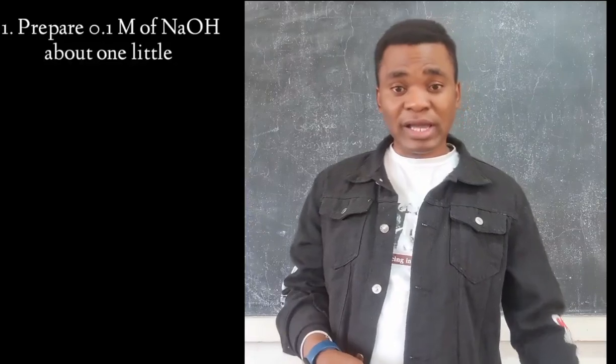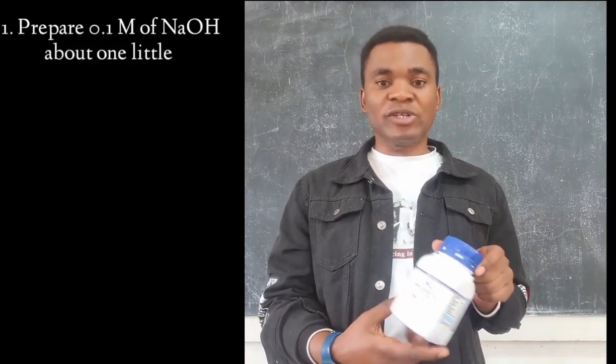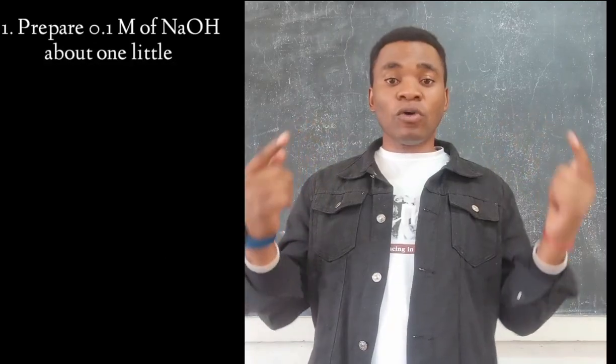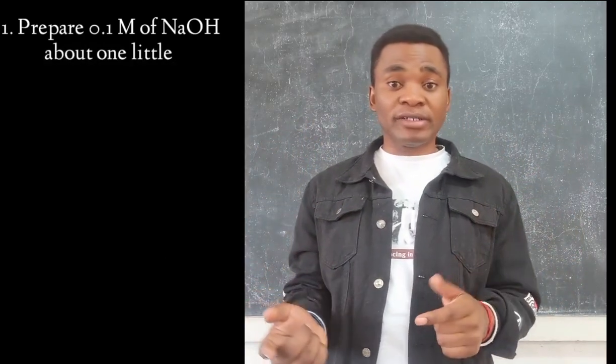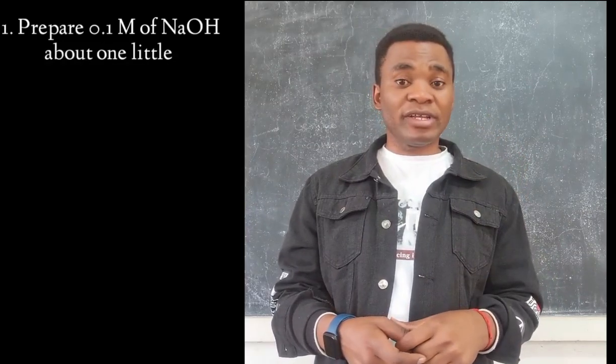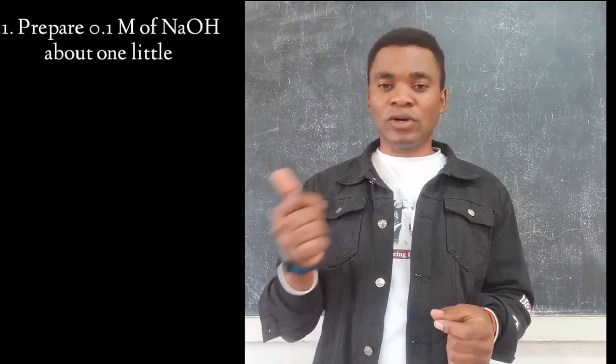So this sodium hydroxide, here it is. I have my sodium hydroxide pellets. And then what molarity and volume do they require? It is 0.1 moles per decimeter cube, and 1 liter.